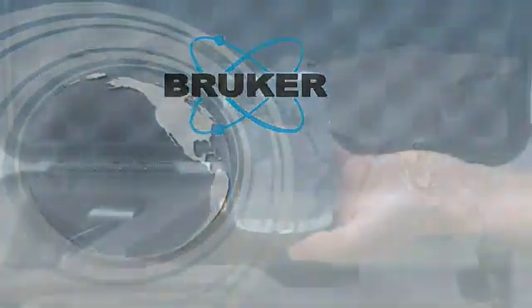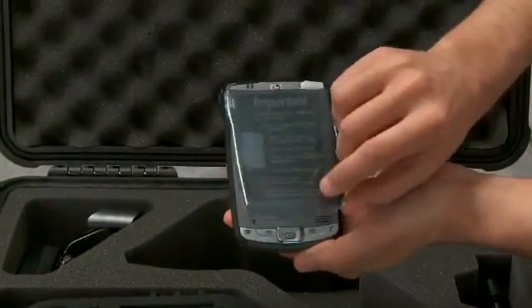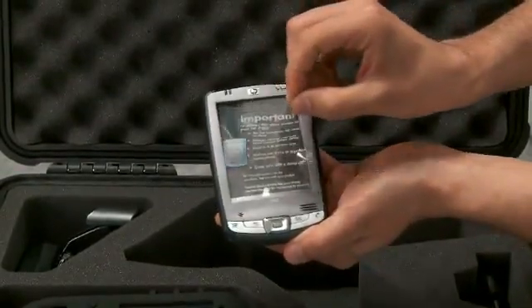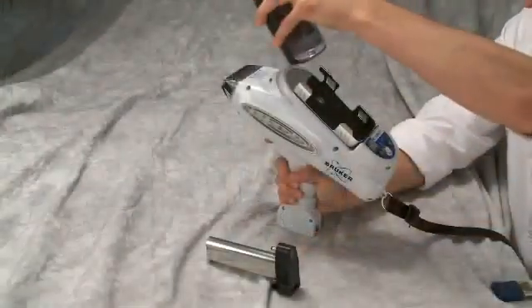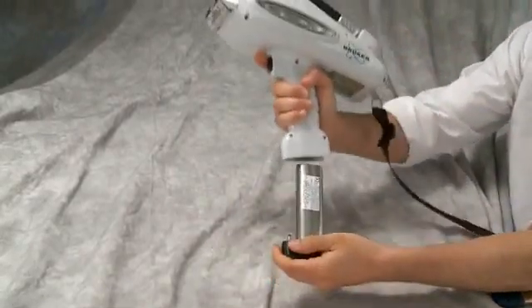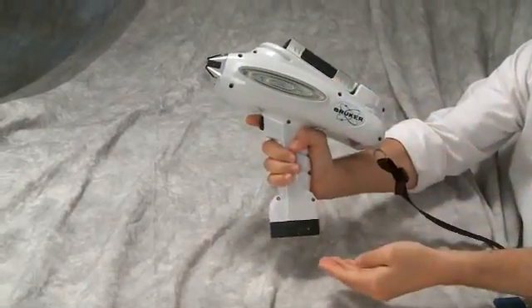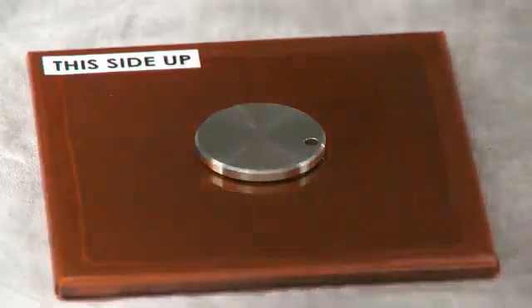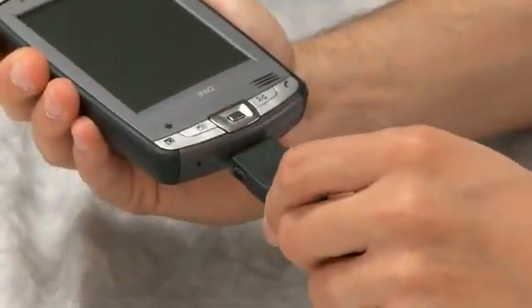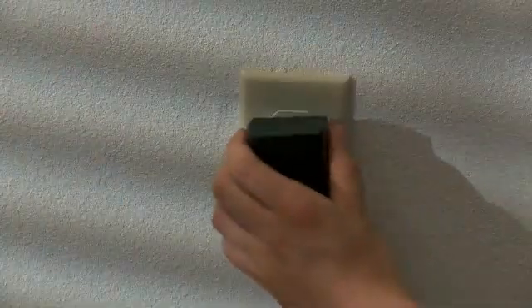The PDA is the main computer controlling and operating the analyzer. In order to prepare the PDA for use, simply remove the plastic and protective covers. Store these parts in the case for future shipping protection. The analyzer and the PDA are battery powered. When operating the analyzer, the PDA draws power from the handle battery of the analyzer. To get the maximum operating time for the analyzer battery, keep both the analyzer and the PDA completely charged. In order to externally charge the PDA, simply plug its charger into the bottom of the PDA and plug the charger into an AC line.